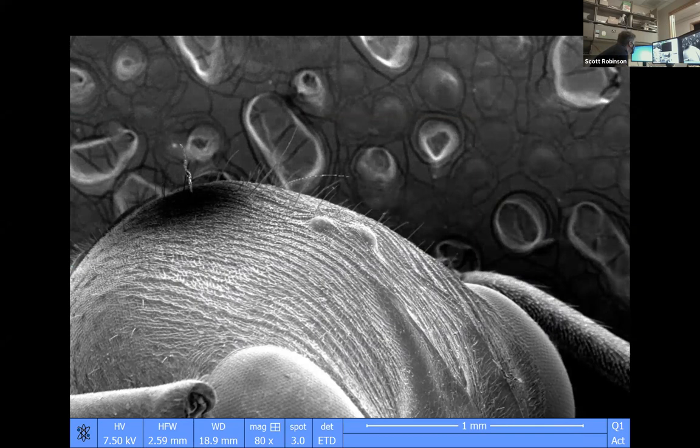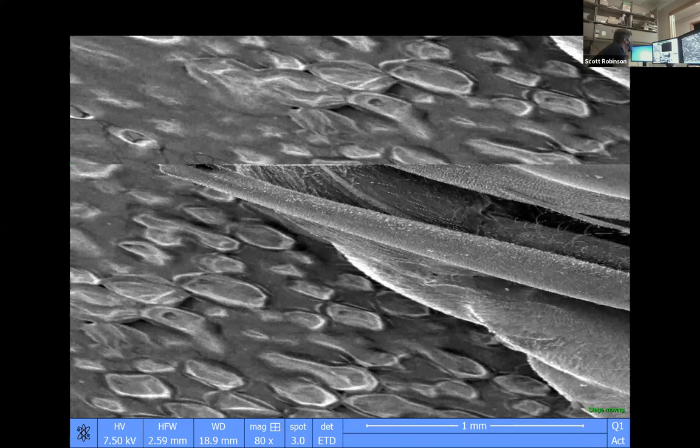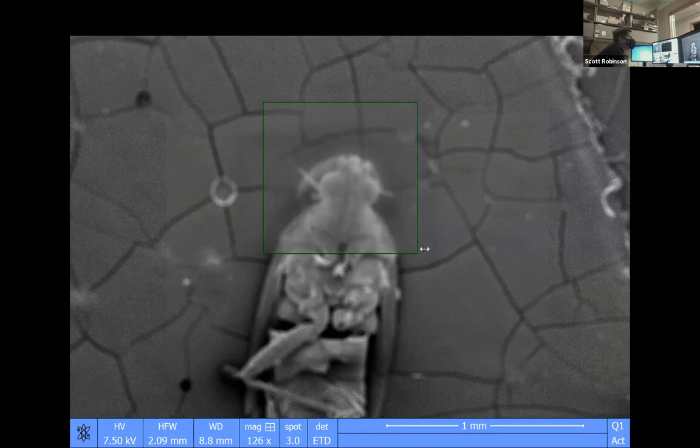So in terms of ocelli, not all insects have those structures. Some of them have lost them, but usually they'll either have three of them or one of them. And then talking about how big the eyes are on Myrmecia, that's not necessarily common in ants. Most ants don't have the best vision. Some of them actually lost their eyes entirely. But Myrmecia are one of the few groups that have very, very good eyesight for being an ant.